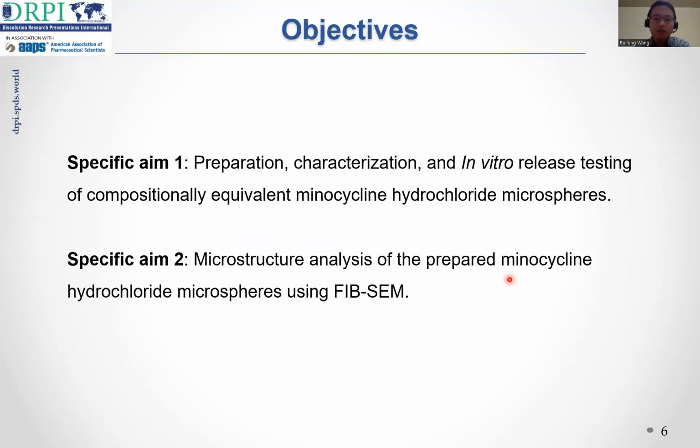In this project, we select Arestin as a reference listed drug, and the specific aim 1 is the preparation and the characterization, as well as in vitro release testing of compositionally equivalent minocycline hydrochloride microspheres. Next is the characterization and analysis of the microstructure of prepared microspheres using FIB-SEM.